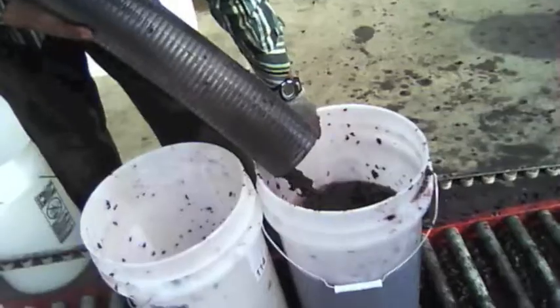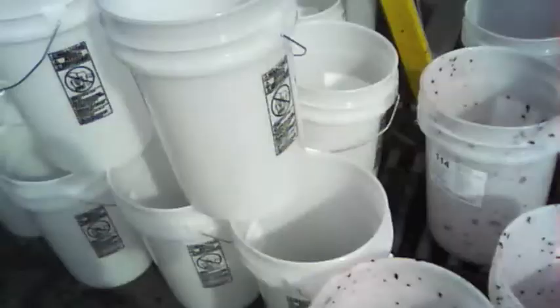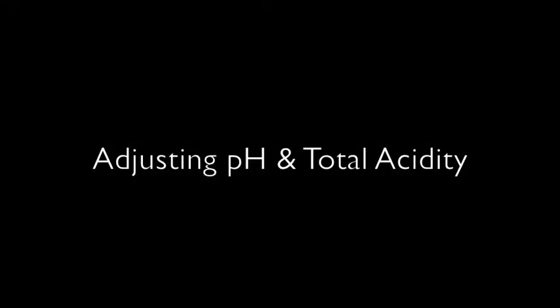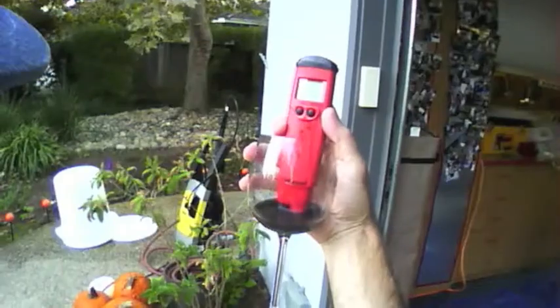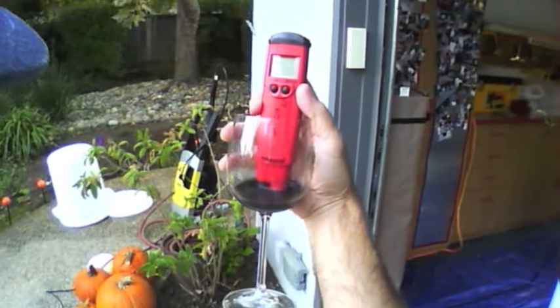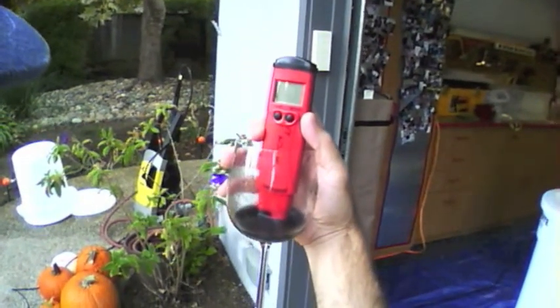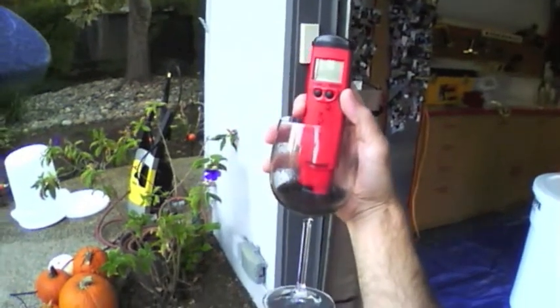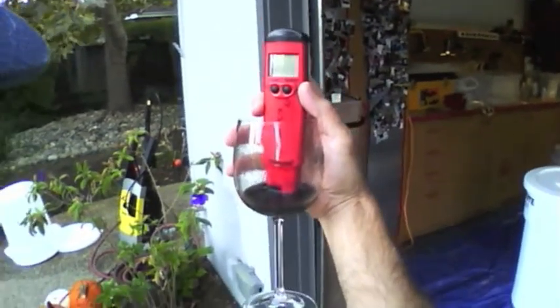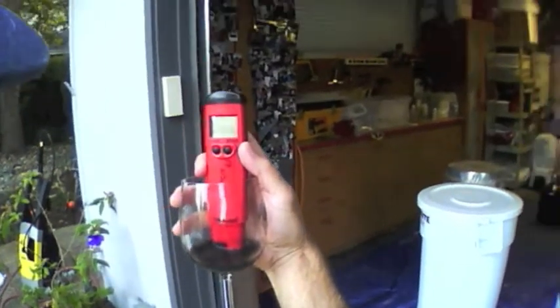On the other end it's coming out into the bucket, and that's the whole deal. Sodium hydroxide solution — every two milliliters that we add represents a movement towards the total acidity. So we added 16 milliliters, and by adding 16 milliliters that means we essentially had a total acidity of 8 grams per liter. And that's the number we needed.